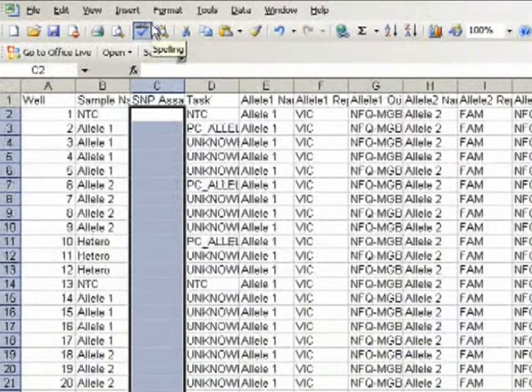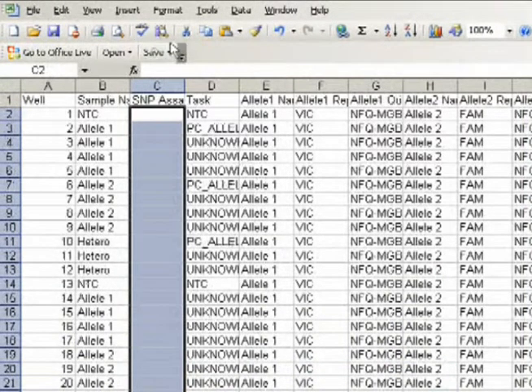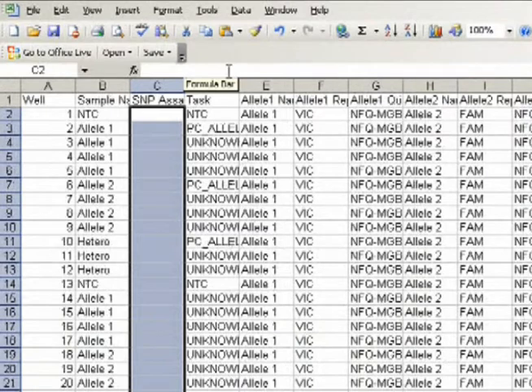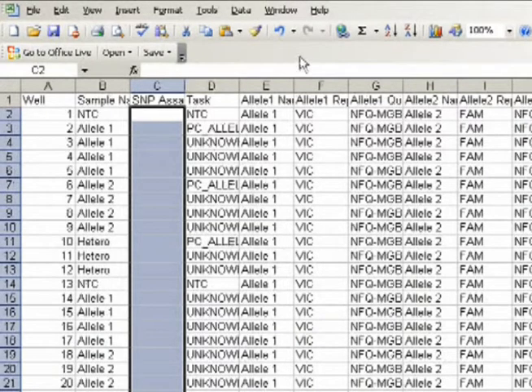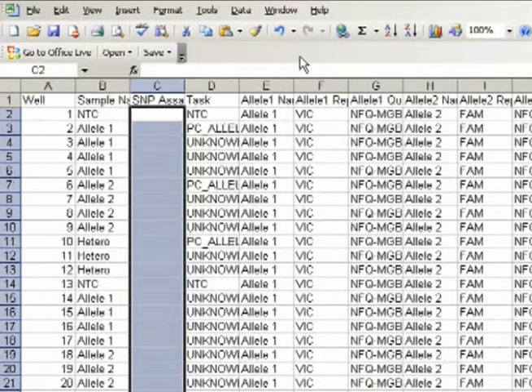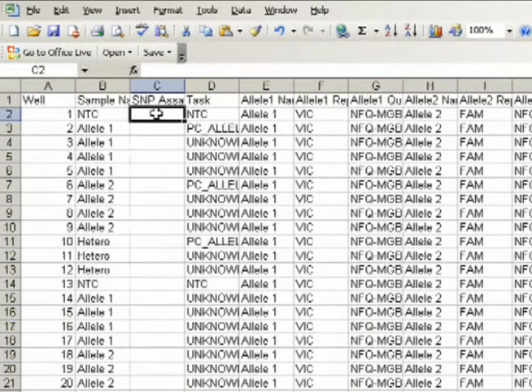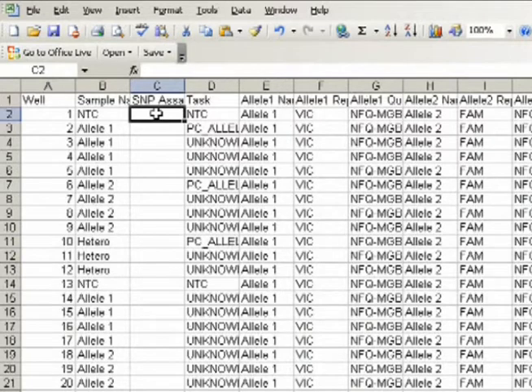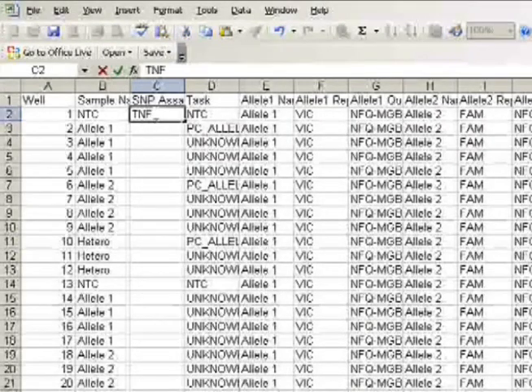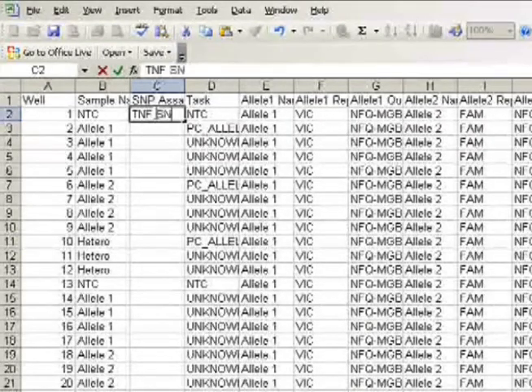And again, I can save this file if I want this information cleared from my template for good. In terms of populating with the new assay name, the great thing about Excel is this. Say I'm about to set up for a new run, and the assay I'm using this time is called TNF SNP.